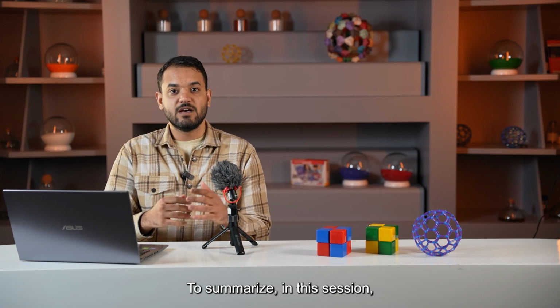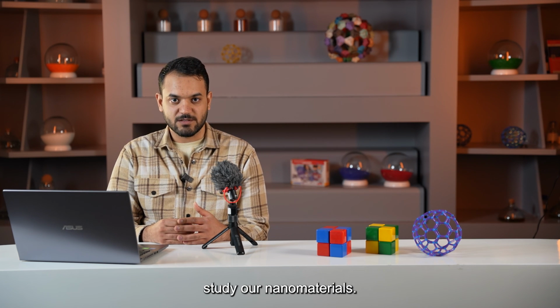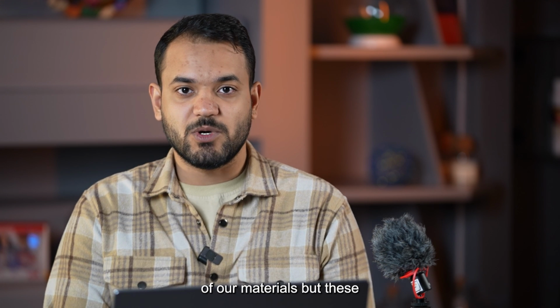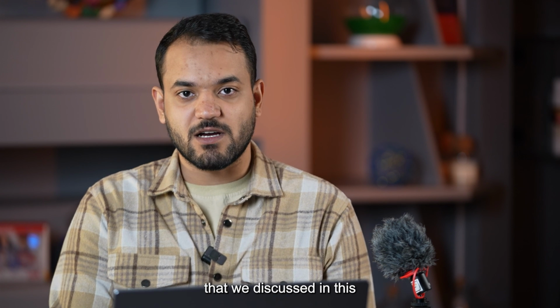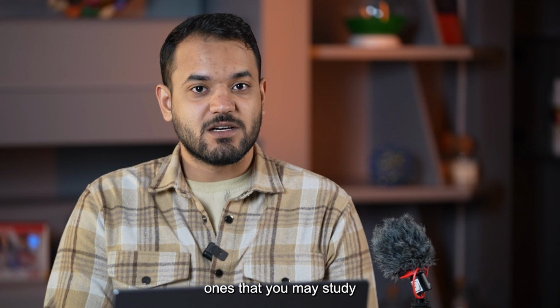To summarize, in this session, we studied some few ways, but key ones, let's say, to study our nanomaterials. There are, of course, many ways for characterization and analysis of our materials, but these 4 microscopy methods that we discussed in this session are actually the few ones that you may study for now.